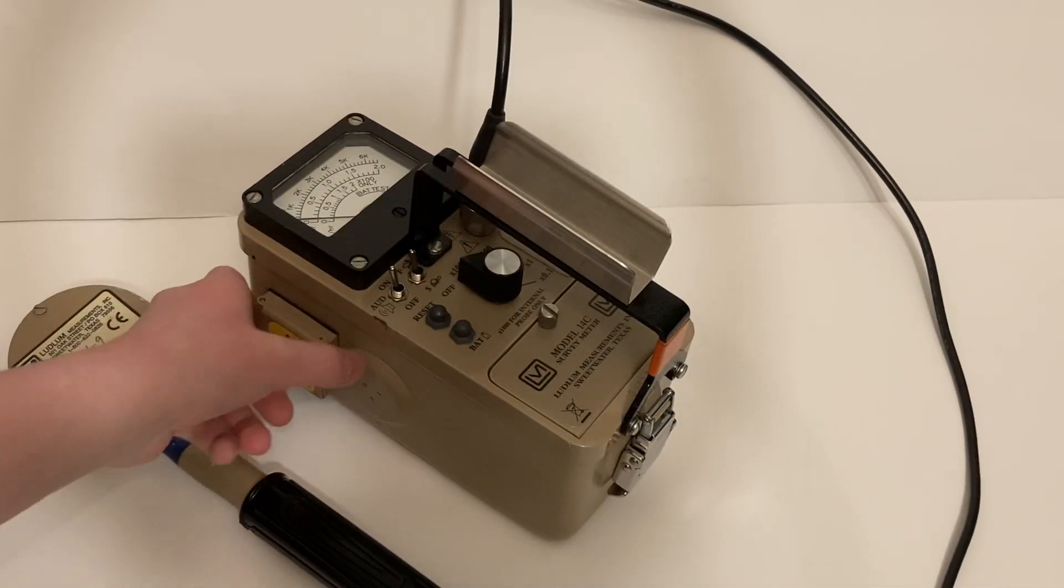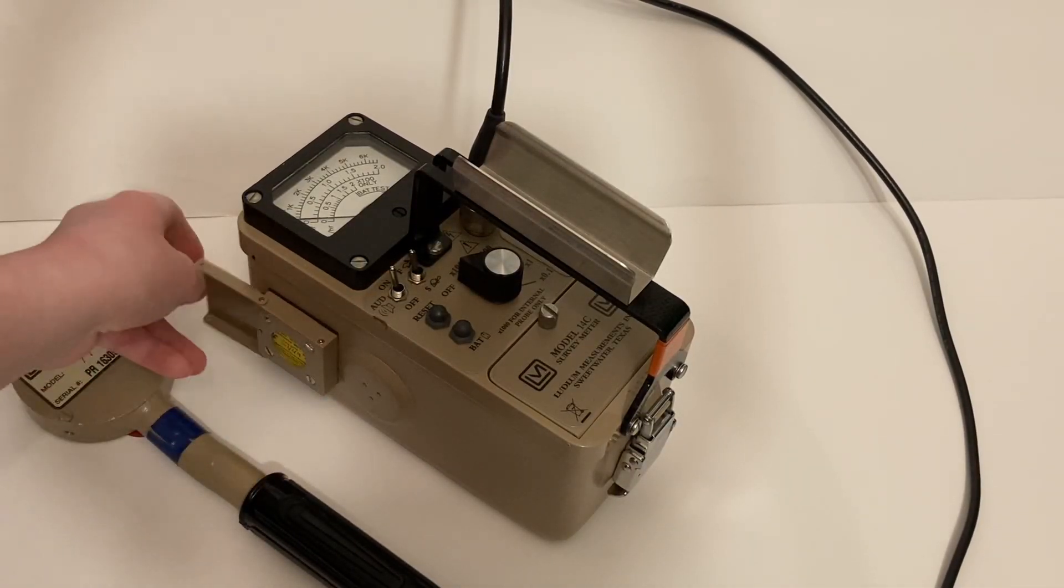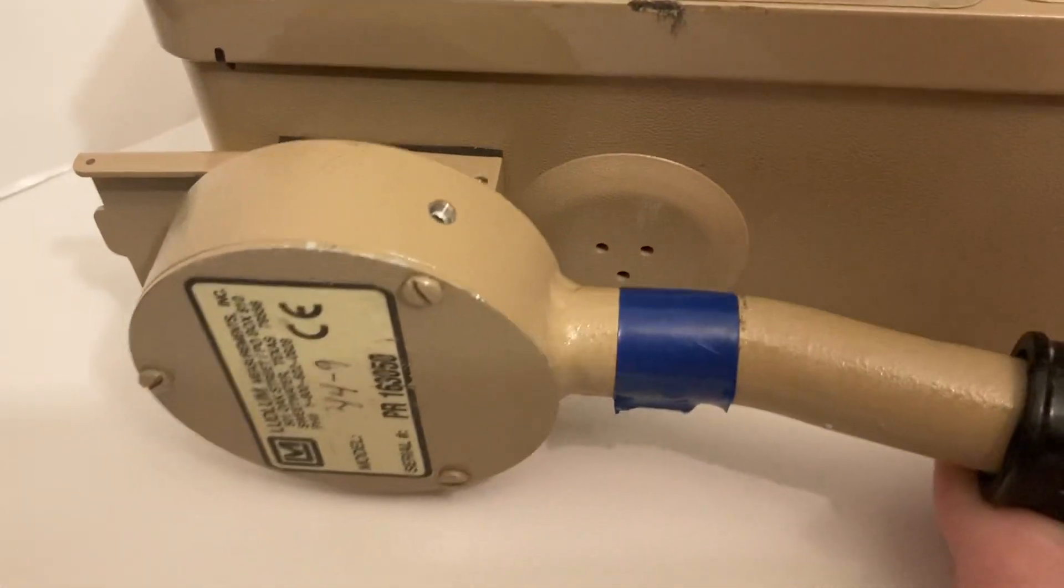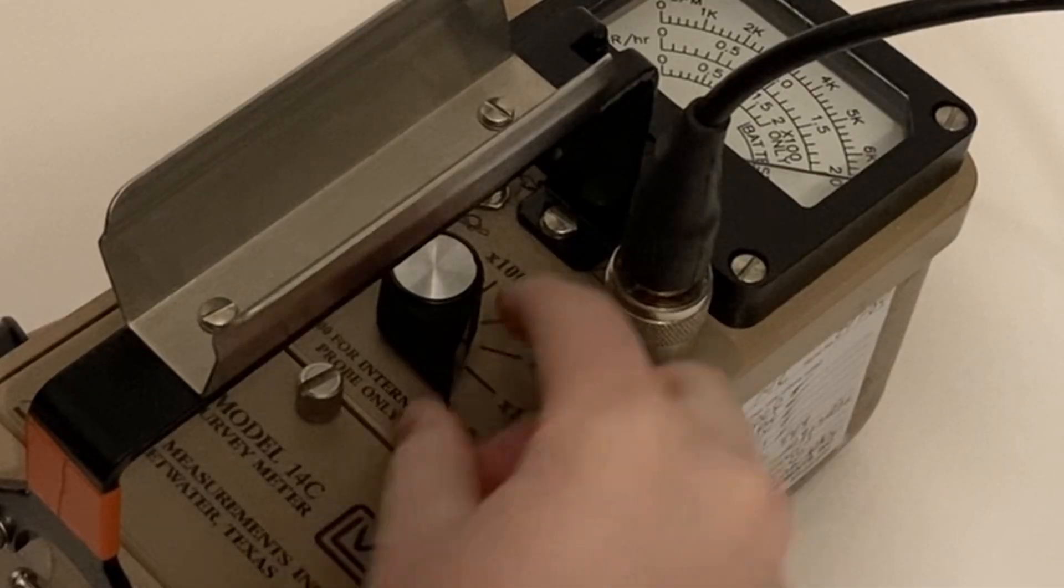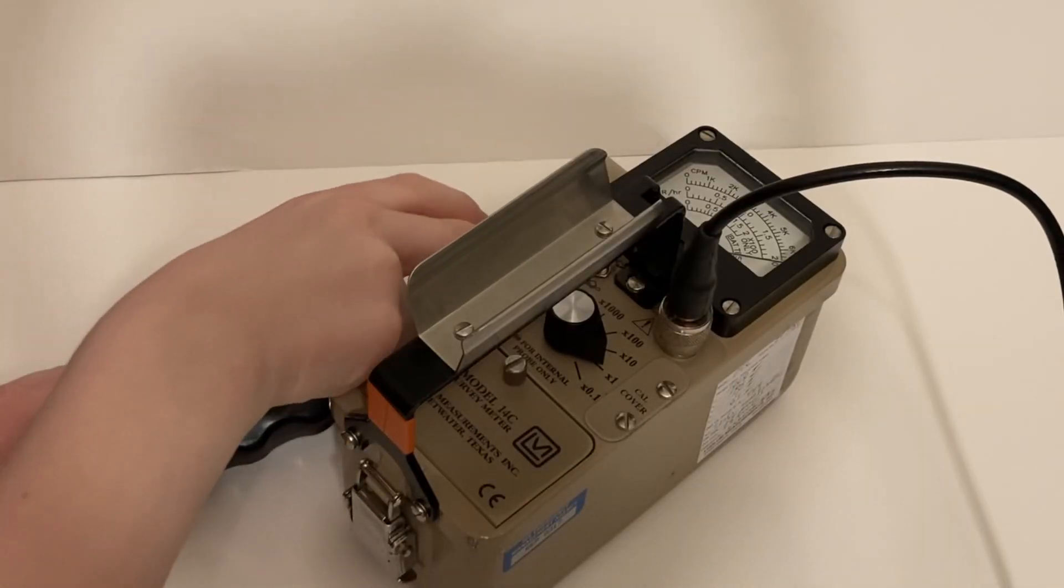Open the door on the CZM137 check source on the side of the instrument. Hold the window of the Model 44-9 up as close as you can to the check source without touching it. Select the appropriate range for the radiation being measured.